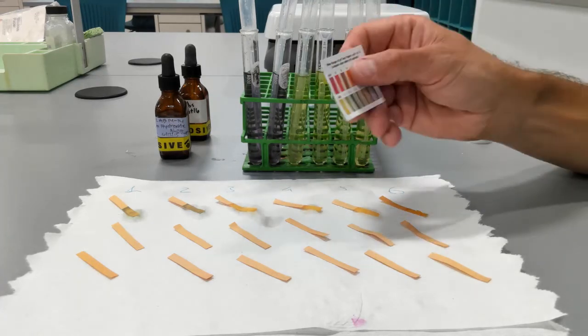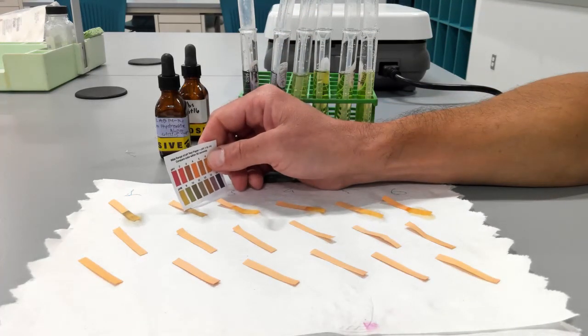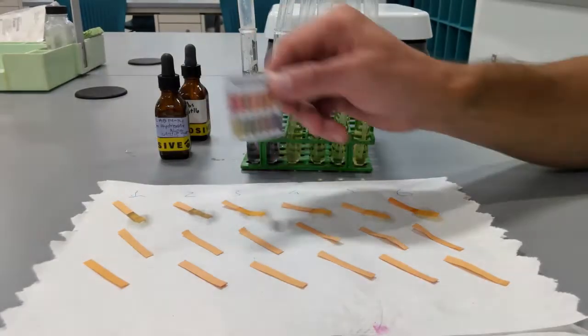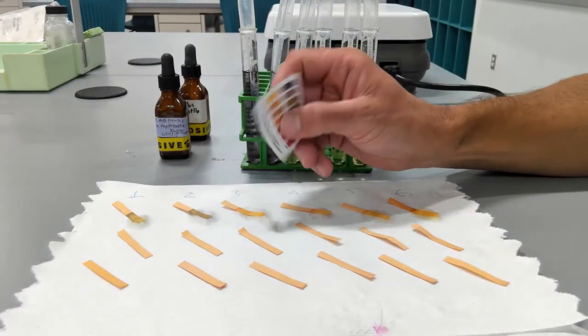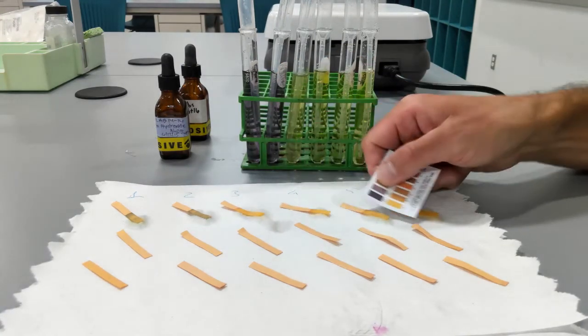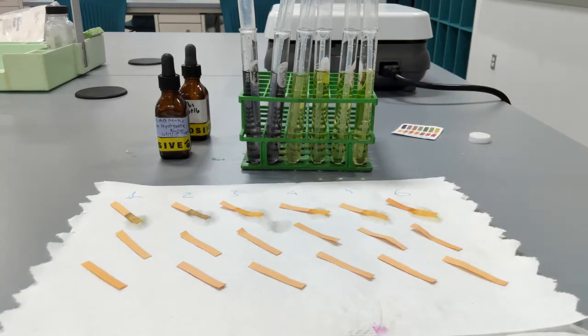So using this comparison chart, we can see that the pH of the carbonate buffer is slightly basic, around pH 8. The pH of the phosphate buffer and water is approximately 7.